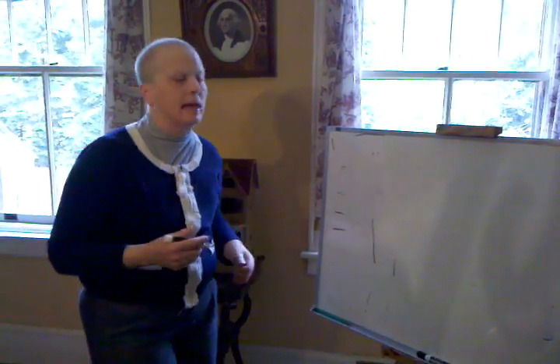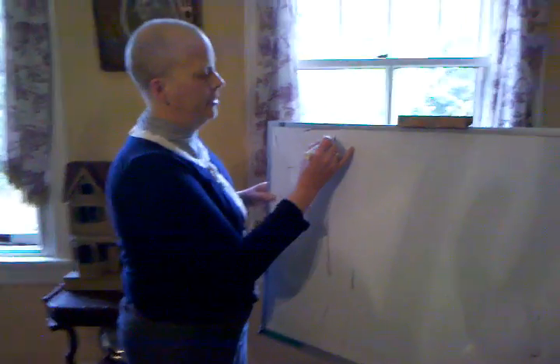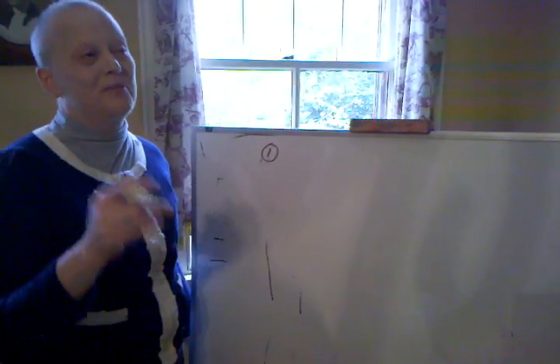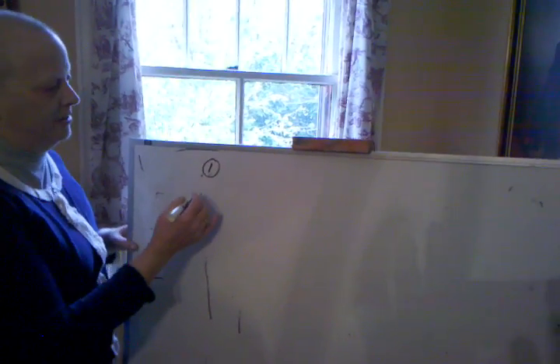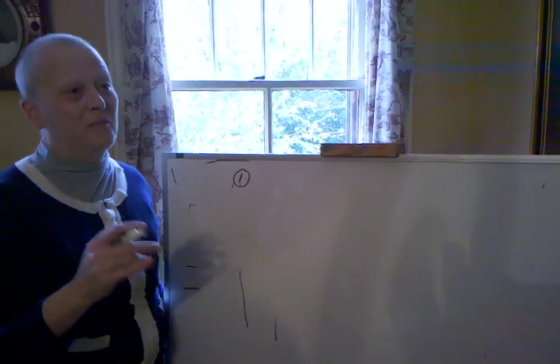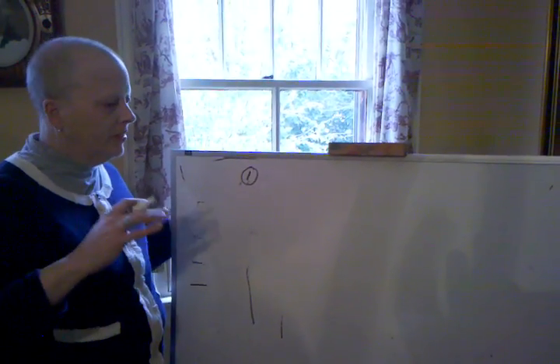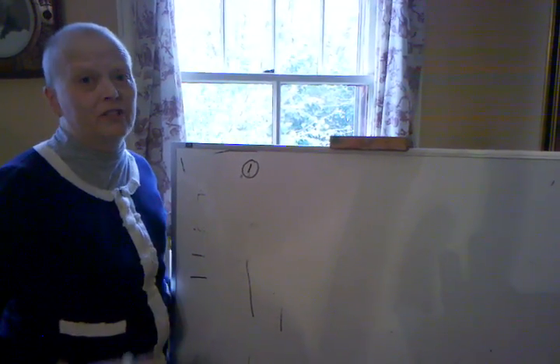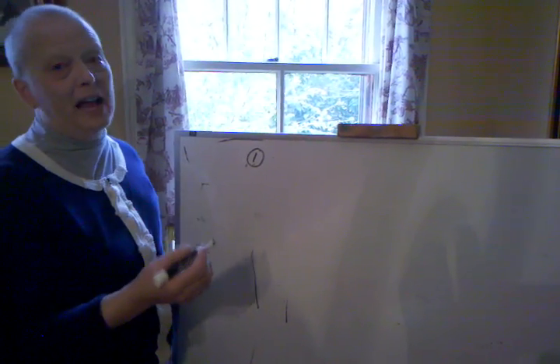Now, when you come into the lab, there are several scenarios that could occur. The first scenario is, and I think this is where most of you are going to be, your cap blew off. I don't mean to make light of this, but a lot of the caps blew off. So your cap blew off, and your solution is just completely dry. It just looks like a big, massive crystal. I think a lot of people are in that situation because the reaction sat for 2 weeks.